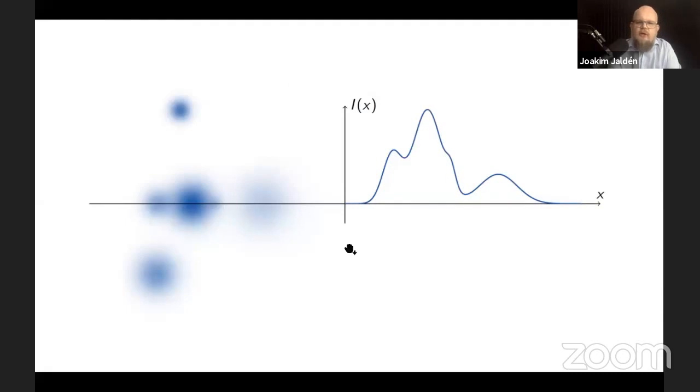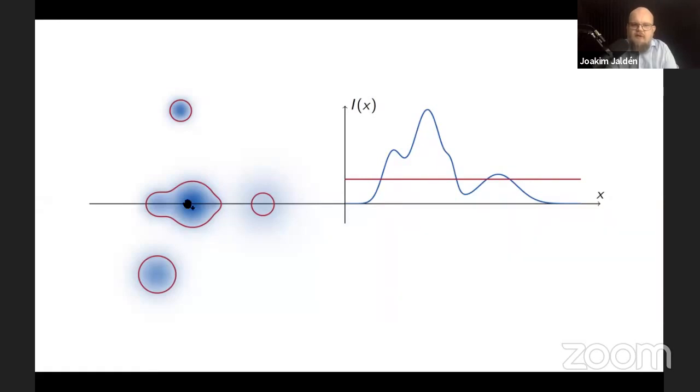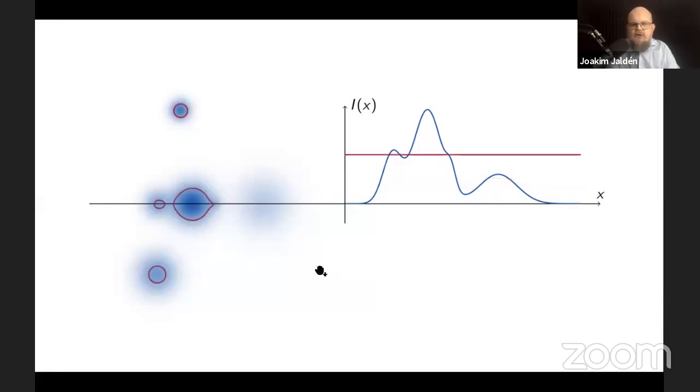So digging into this example, by drawing a line through the 4 spots that I conveniently placed along the line here, you see the intensity curve here, right? And there are a number of standard ways of addressing spot counting problems. The first and perhaps easiest would simply be to apply a threshold, and to threshold anything where intensity goes above this threshold. The problem with that, of course, is that if you have several spots lying close to each other, you may segment those as a single group, and you have to come up with some heuristic in order to break up these clusters. And you can play with the intensity, of course, in order to try to break up the cluster, but that may lead to you missing weak spots or spots of low intensity, even if they're large. In this case, you can see, even though you can break this cluster into 2 spots, there is no level that can identify this spot here, which is partially occluded by the strong spot.